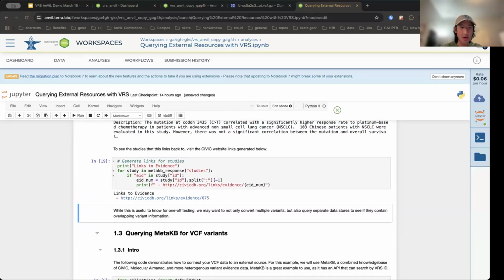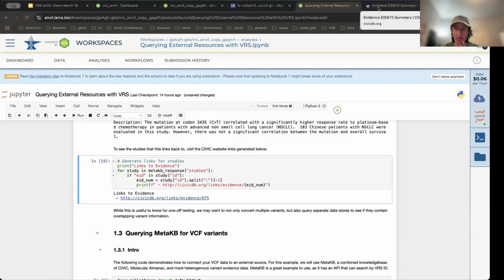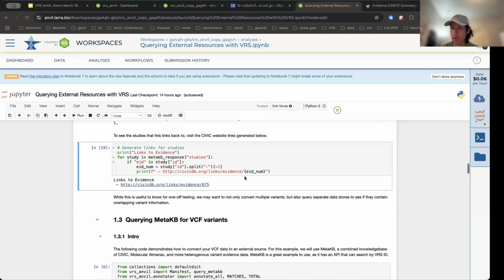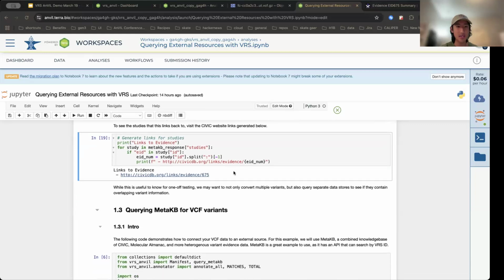And so just to tie this back and show you a different way of showing you the Civic data, they have an awesome platform that you can reference and take a look at if you wanted to see this more in a visualization format before diving into and continuing to process that data on Terra itself.